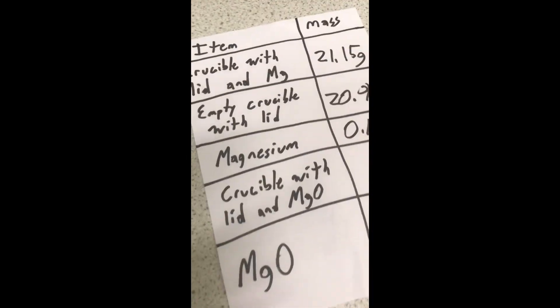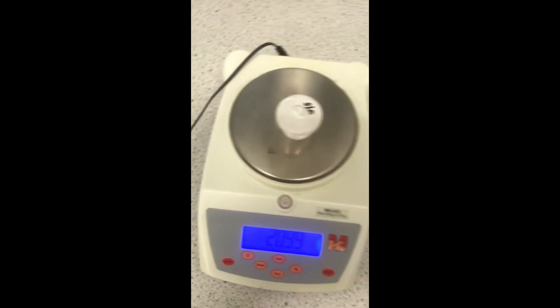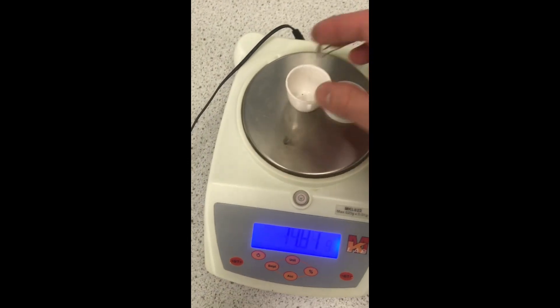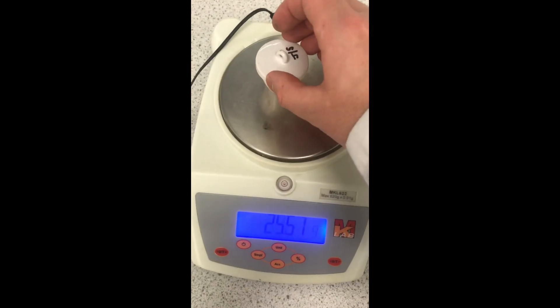Now, what I'm going to do, I'll place the magnesium back into the crucible, put the lid on, and using tongs, I will place this over my setup.